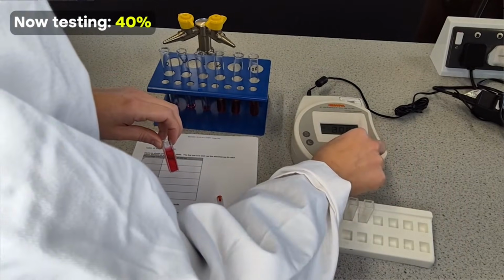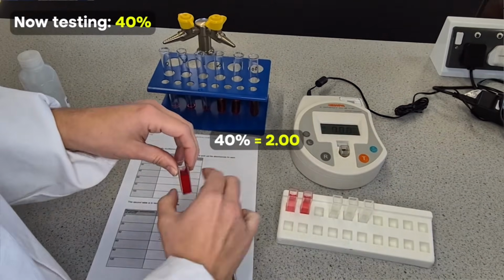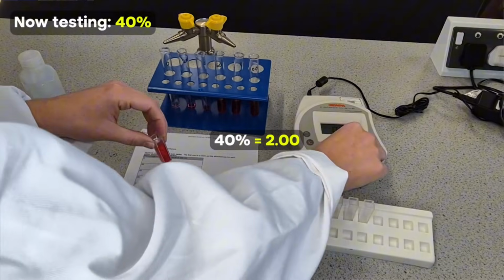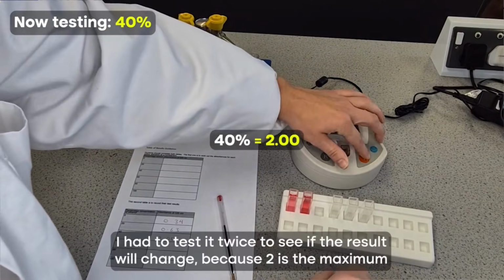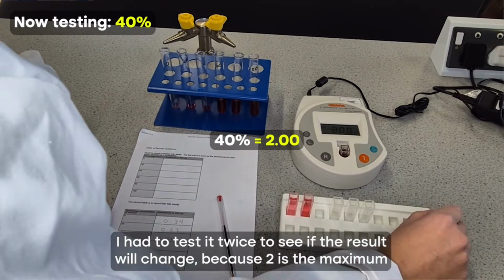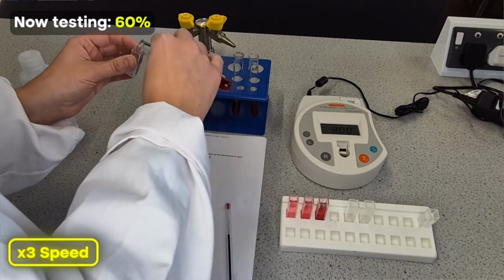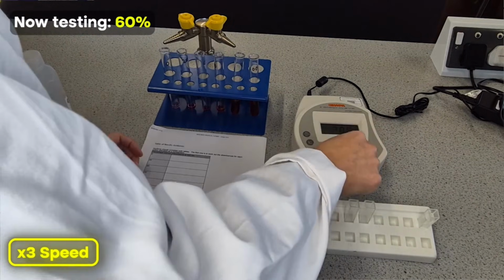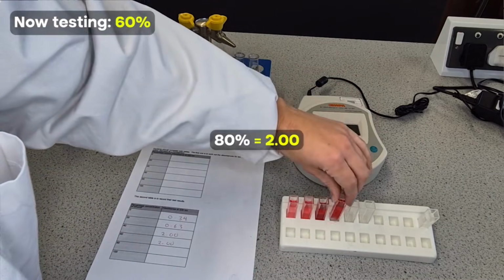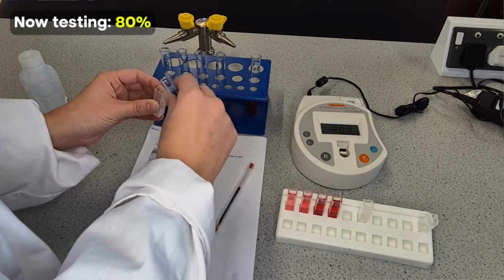So I'm just going to 0 again, just to make sure. Oh, hang on. 0 again, pressing the R. And then test. So it is still saying 2. I suspect these are all just going to say 2 now because 2 is the maximum. And we'll talk about what you could do to overcome this.